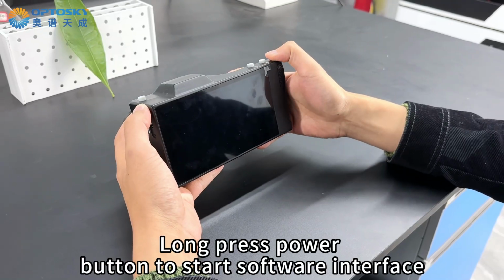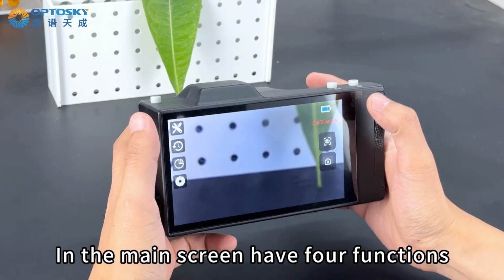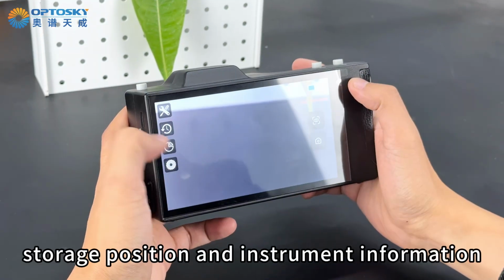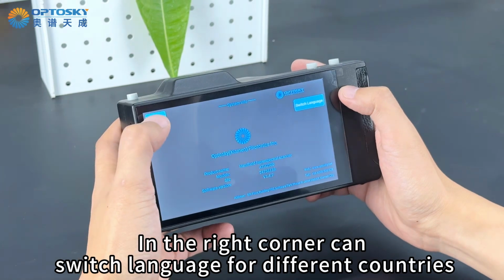Long press the power button to start the software interface. Wait a second for the main interface. In the main screen there are 4 functions: setting, historical records, storage position, and instrument information. In the right corner, you can switch language for different countries.